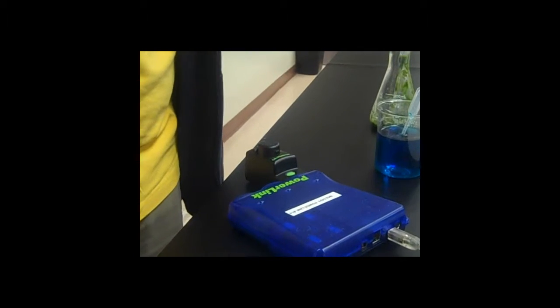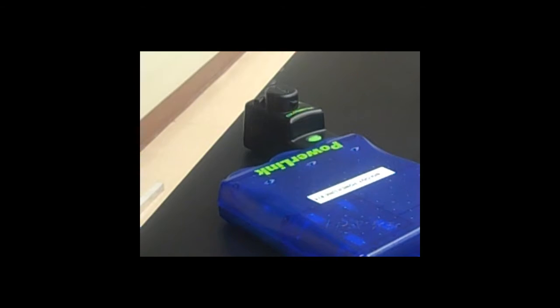Cuvette 1 is a blank control. It's put into the colorimeter and recorded, pressing the button. This sets the standard percent transmittance for the other cuvettes. We'll be taking the initial transmittance of each cuvette.